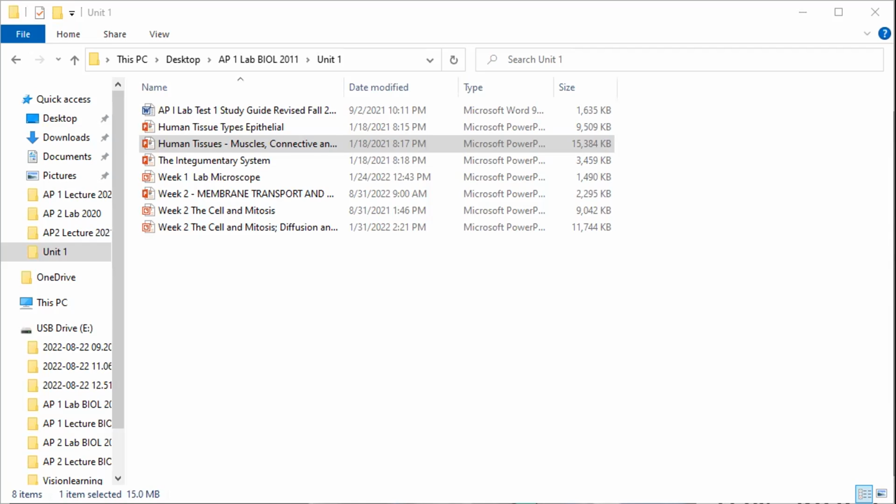They're lined up, layer on top of each other, but each cell has its own nucleus. So like there, or it looks like this. Again, this is smooth muscle right there, layer upon layer upon layer, and a close-up of that again.